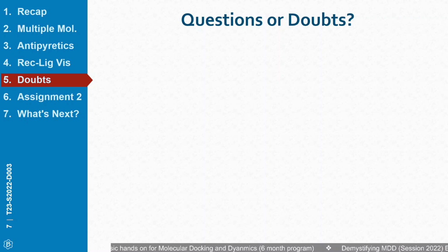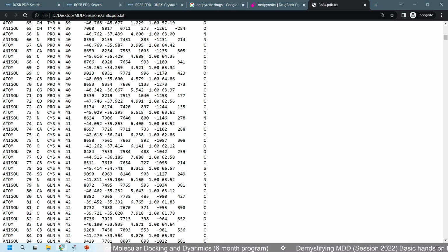See here, you have only the option for amino acid: aliphatic, aromatic, charged, hydrophobic, negative, polar, positive, small, tiny. Sir, how do we differentiate between amino acid and non-amino acid? Okay. You are using the residue option, right? Try the structure option. What's in the structure option? Backbone, ions, ligand. Click on ligand. Ligands.